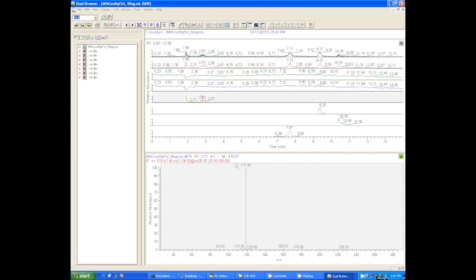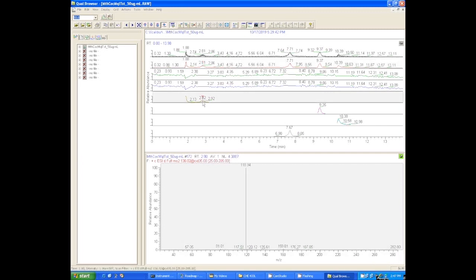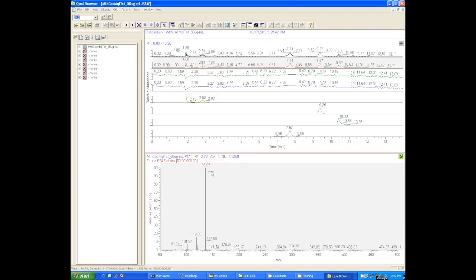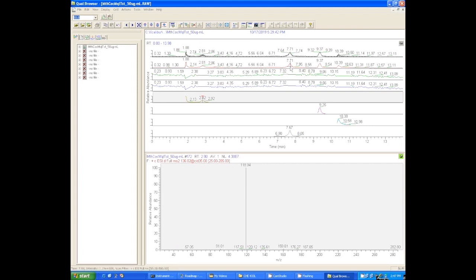When we click on that next one down, there's that peak for amphetamine, but in the MS/MS that is the MS/MS spectrum for amphetamine. So in one run we've captured the 136 in the MS1 spectrum and the 119 for the MS2 spectrum.